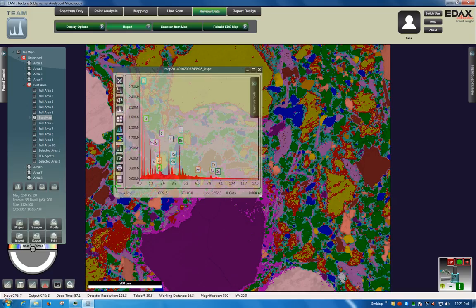Finally, there are larger ways of exporting data in bulk, and that's with the periodic database backup function. Every 28 days, you'll get a prompt from your system that says, would you like to back up your data? If you would, then you click on yes, and you can then save the backup of all of that data, so all of your projects, into a different location, including a portable hard drive location or a network location.